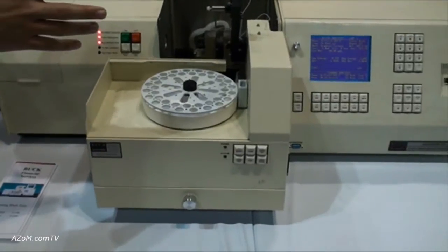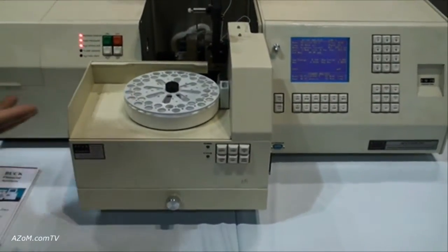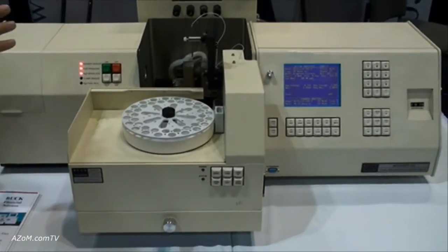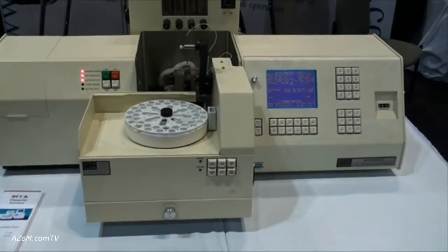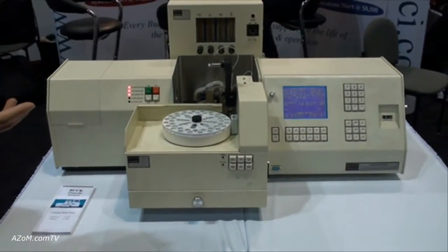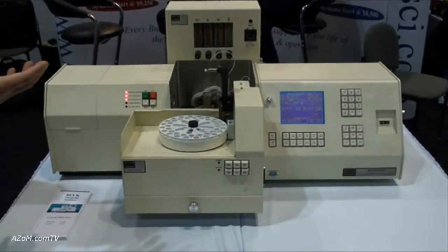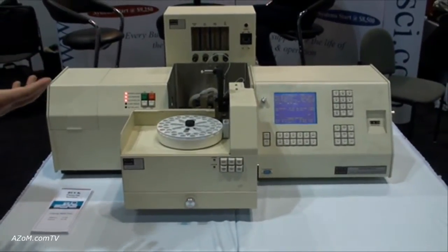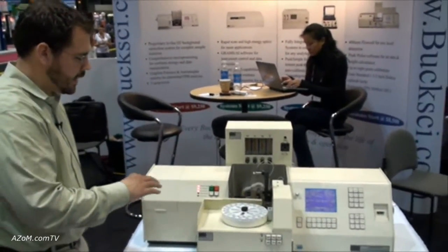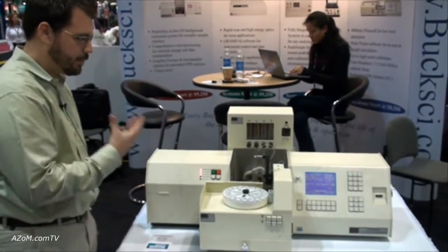We highly recommend using the autosampler with the graphite furnace for reproducibility purposes. The graphite furnace is excellent for very low level work in metals and can handle any sort of matrix, because it removes the rest of the sample other than the metals you're interested in. For most metals we see limits of detection around the part per billion range, sometimes even lower — it's very, very sensitive.